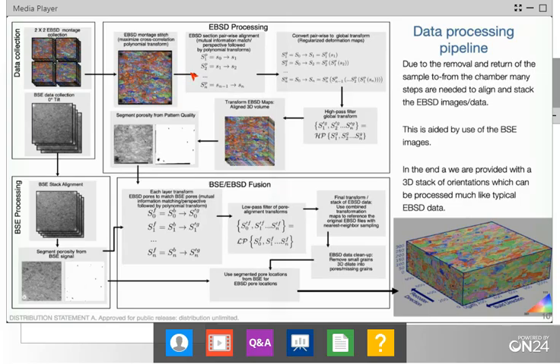It was found that here we needed to use a fairly complex set of transforms in order to get things to line up. It's a combination of perspective transforms along with a second degree polynomial, or quadratic function, that gives us enough freedom in how we warp these images in order to get good matching from section to section.